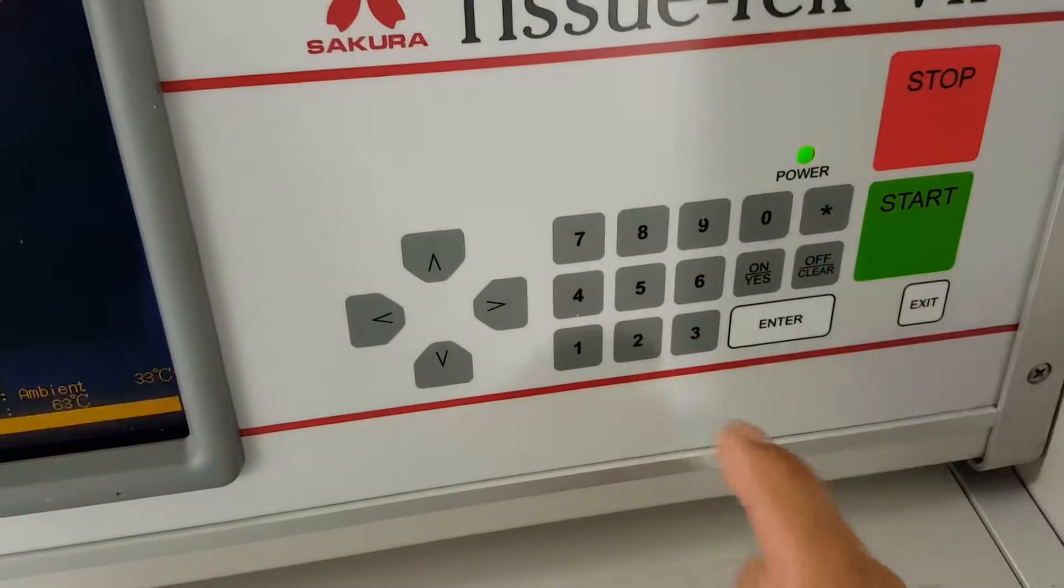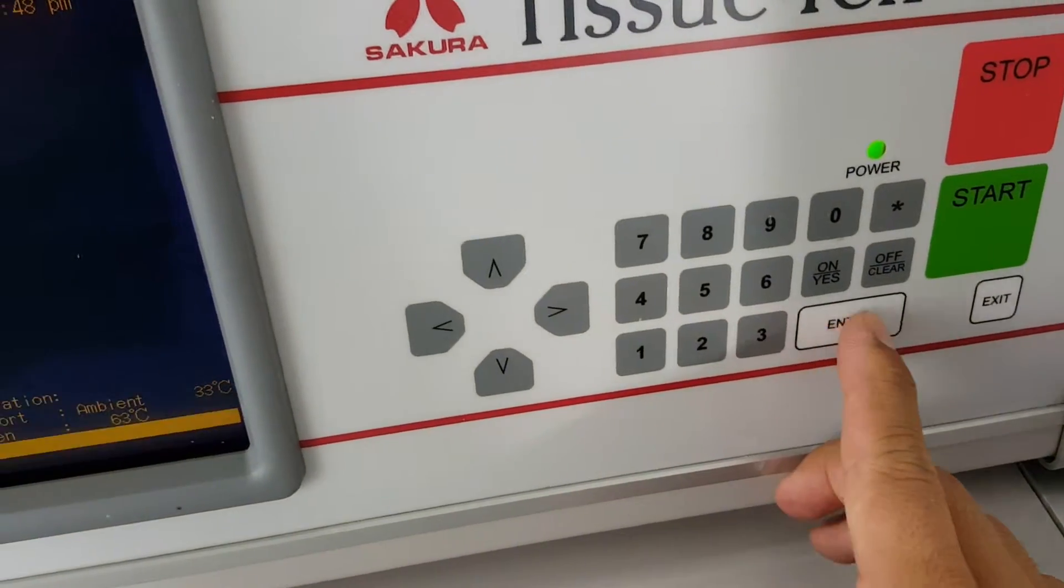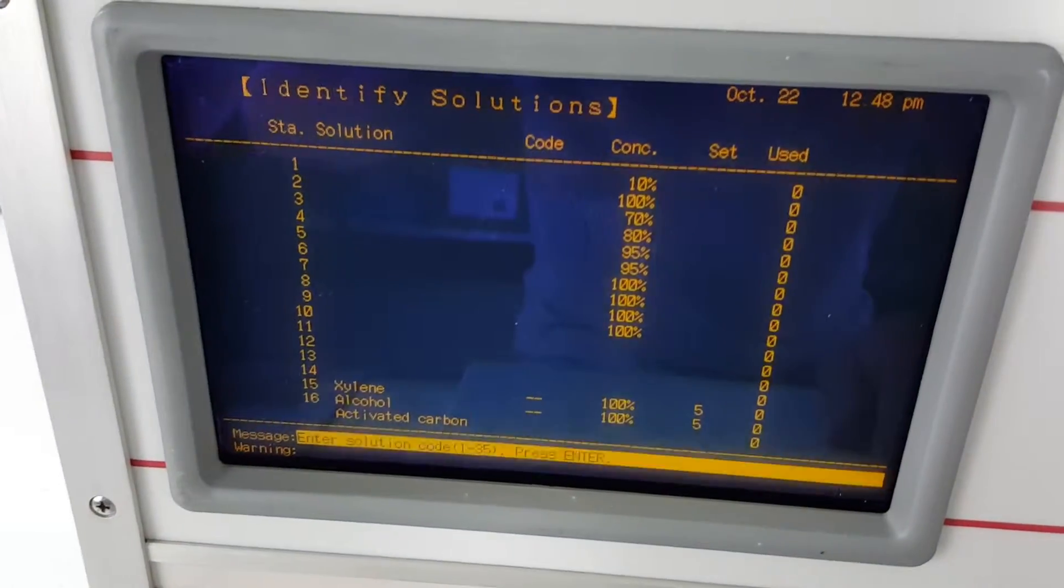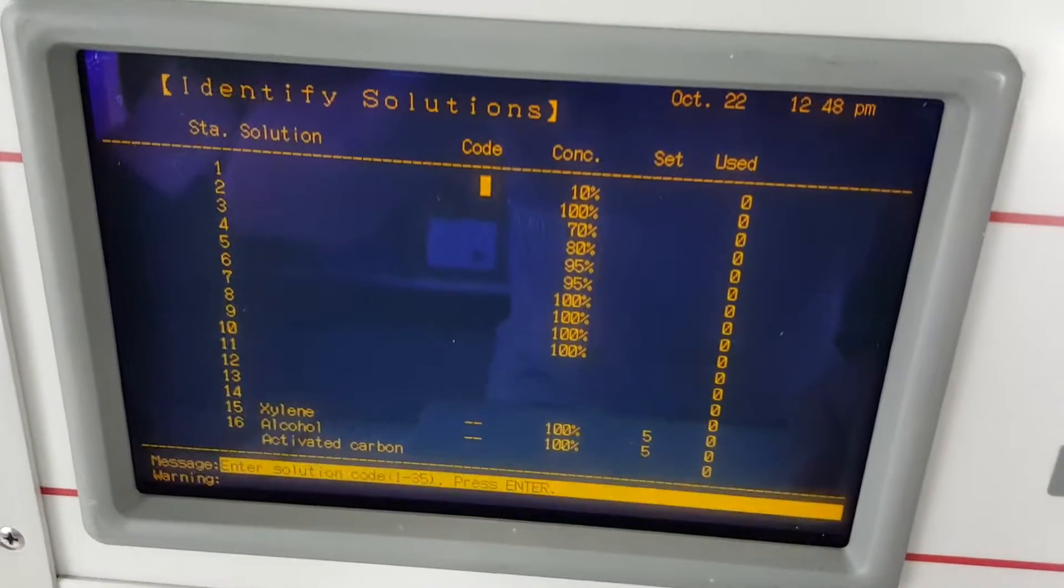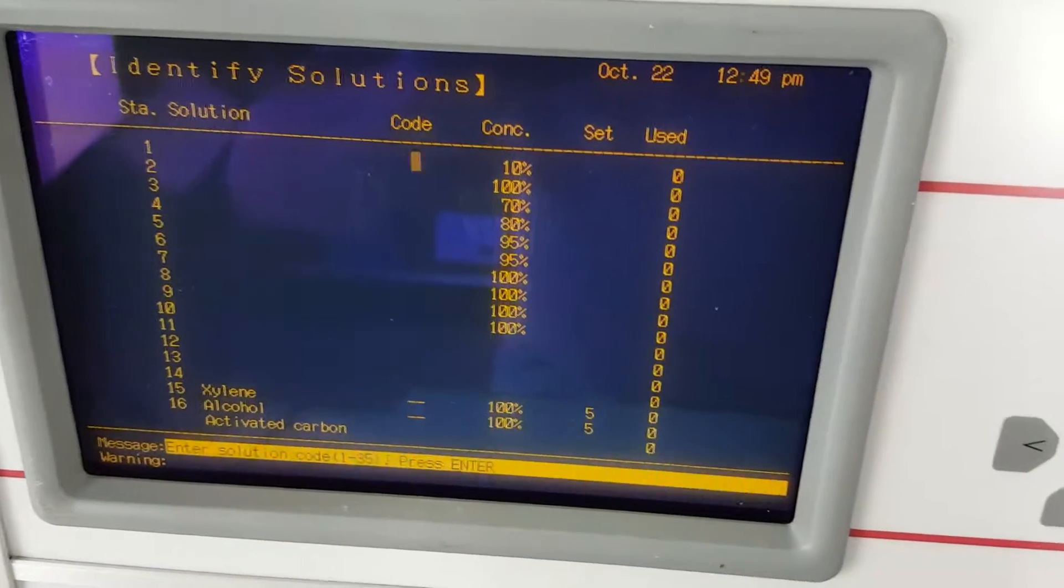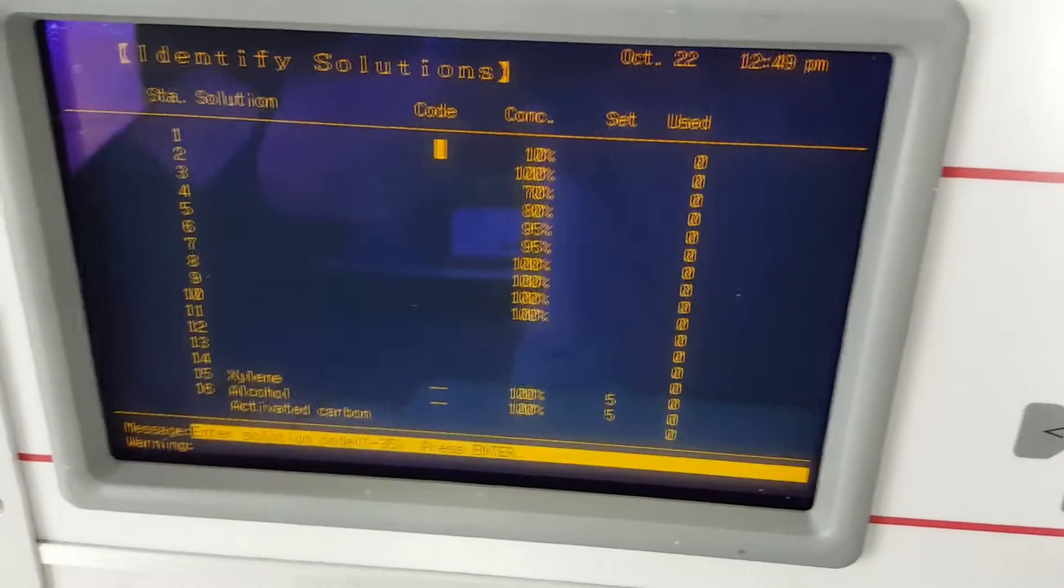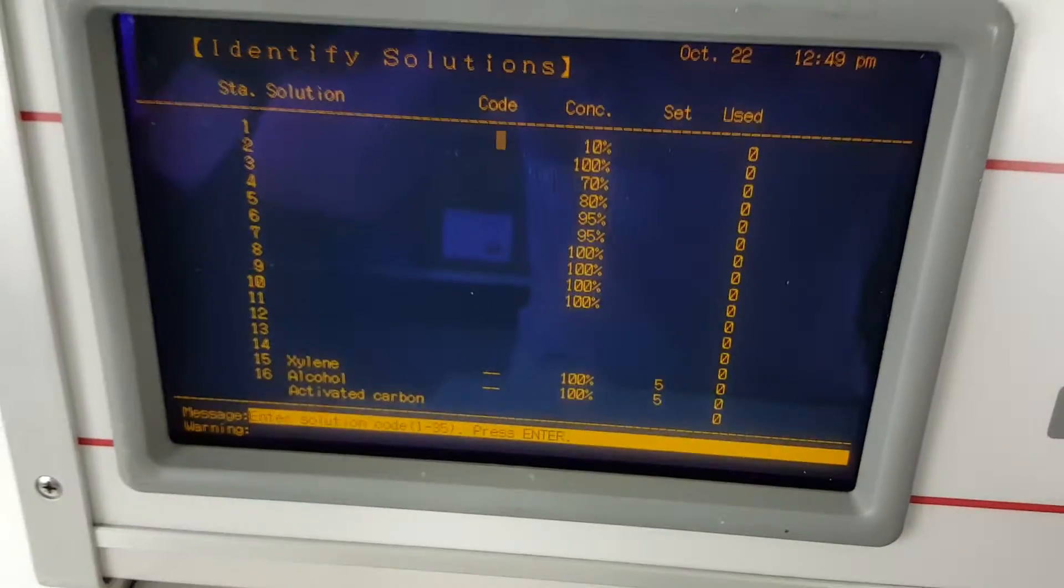To get there you just press three enter and you'll come up with the station solution, the code number, the concentration, the set column and used column and I'll describe those later.